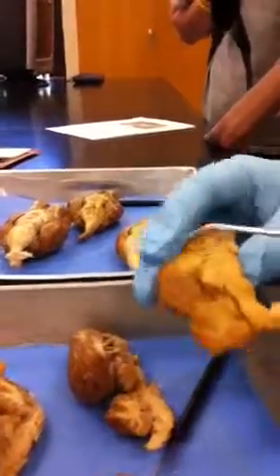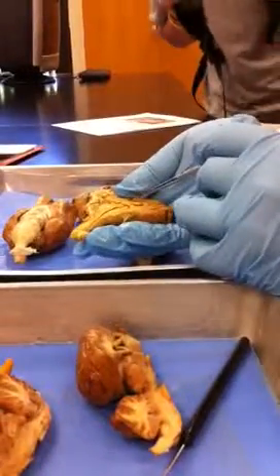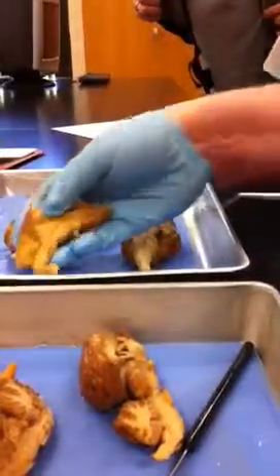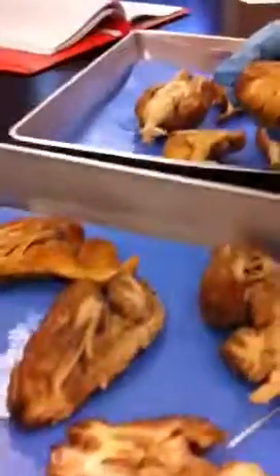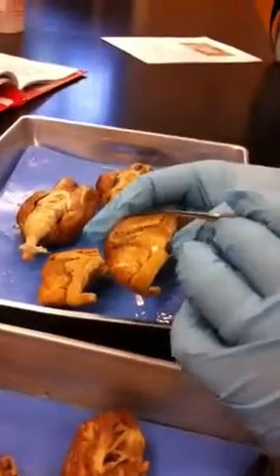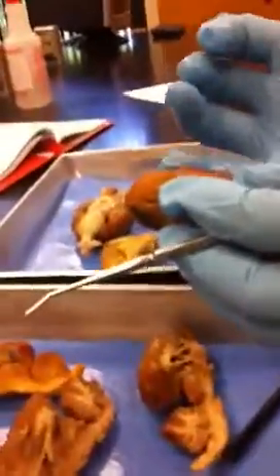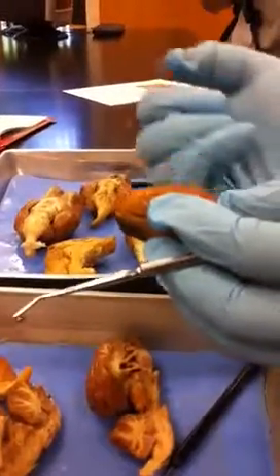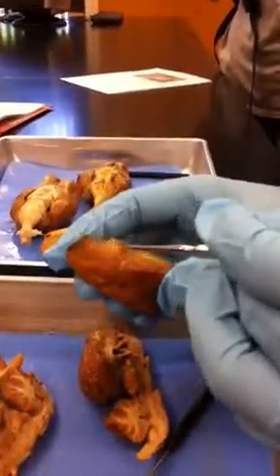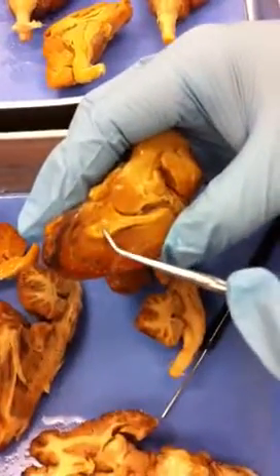Septum pellucidum. I'll try to find it. This one has a little bit of a piece on it. You see this tissue hanging right here? A freshly dissected one would be the best way to see one, but this one's got it. See how the lateral ventricle's not open? There's that tissue there. That's septum pellucidum, because there are two lobes, and the medial wall of the lateral ventricle is formed by that septum pellucidum layer of tissue. So the septum pellucidum is a thin layer of tissue in the center of those lateral ventricles right there.